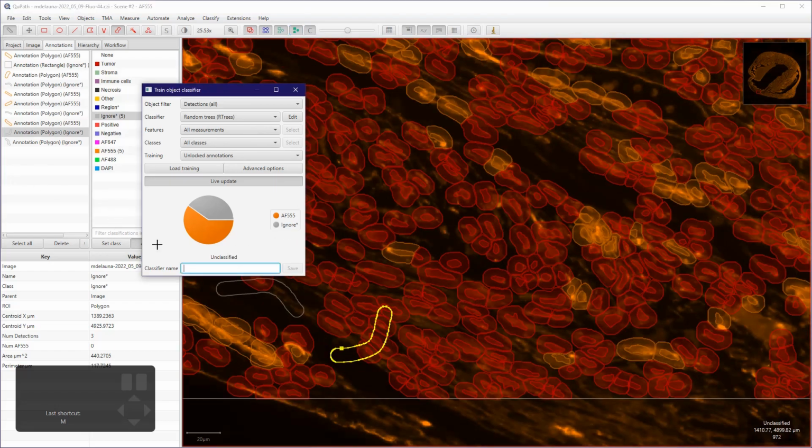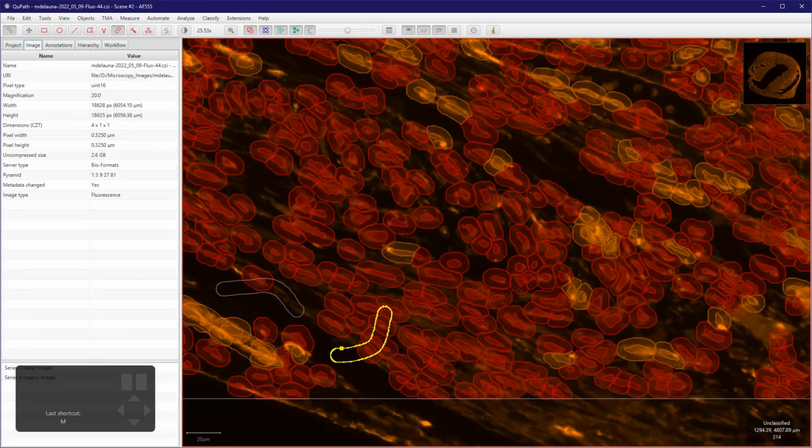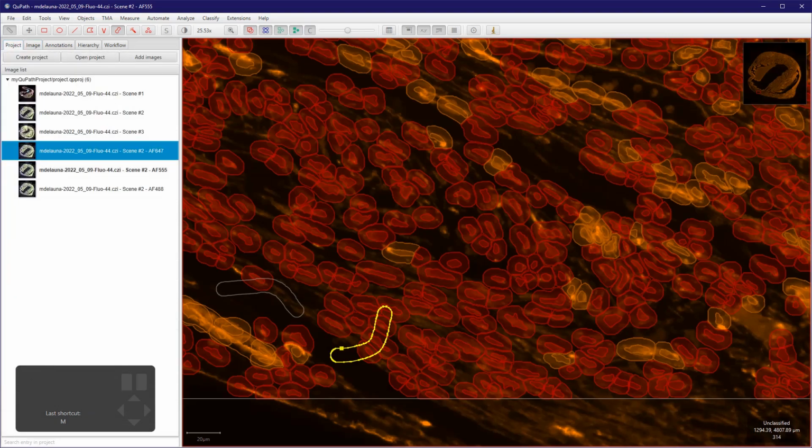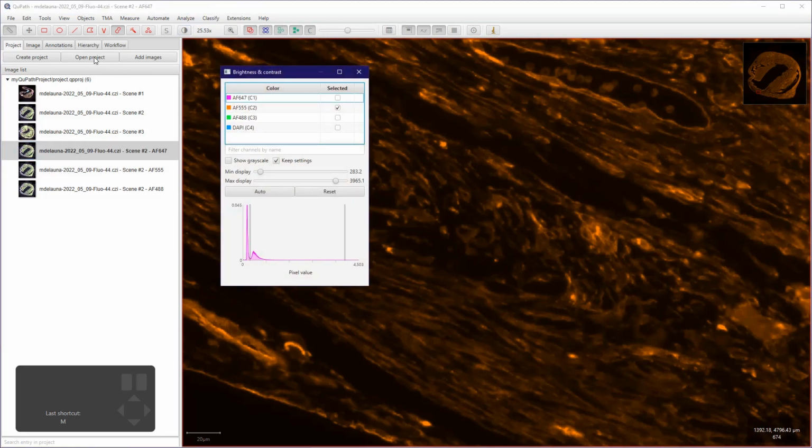So let's save this as AF555 cell classifier, and save this. So let's quickly do the last channel. Same thing.